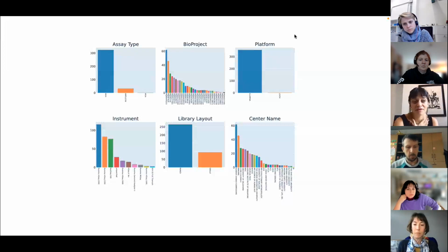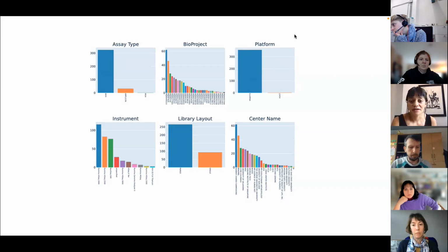That's why, if you have a more reliable set of sources, and you can come up with your own k-mer matrix of sources, running it in this decOM MSD implementation is probably going to give better results. So yeah, that's most likely a source of bias in our results. Oh, thanks.